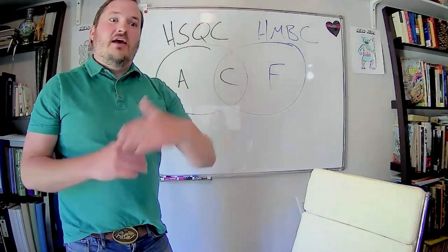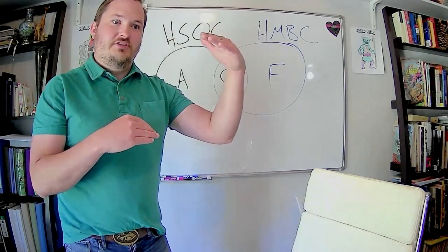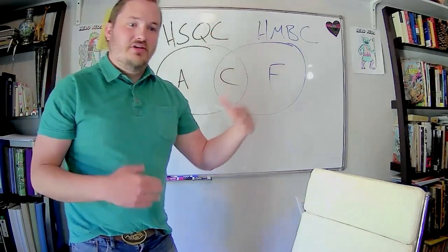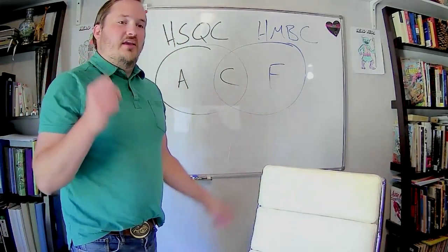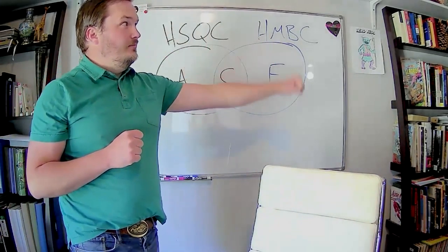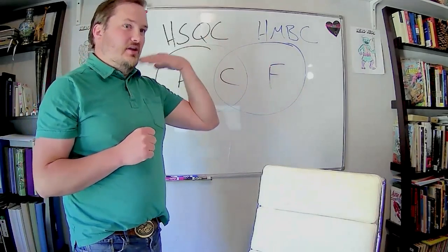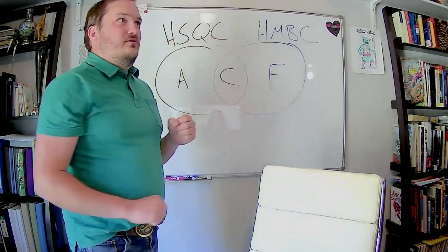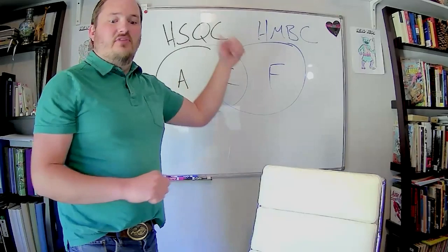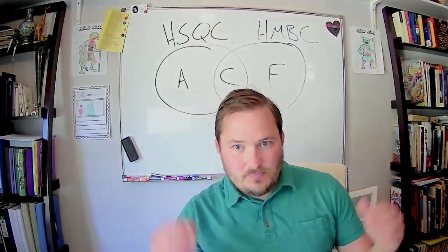And so a lot of these, you're going to have to go through and look at them multiple times, give all the possibilities for all of the different options, and then go back and cross-reference your different summary sheets for each of them to see what that will allow you to tell. And a lot of times, as soon as you can assign one thing with certainty, that's going to start like dominoes.